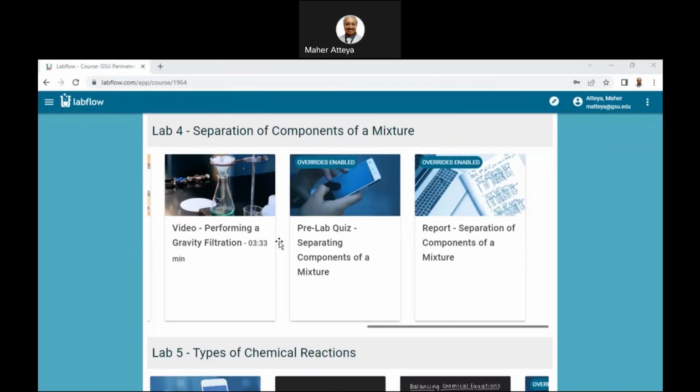So this is number one. This is number one we have to take care of. This is the file we have to look into. And that's the theoretical background. So this is here, theoretical background. If I enter a text, I can enter text here, or enter the text here. I'll say this text maybe will go, try to get this one here.